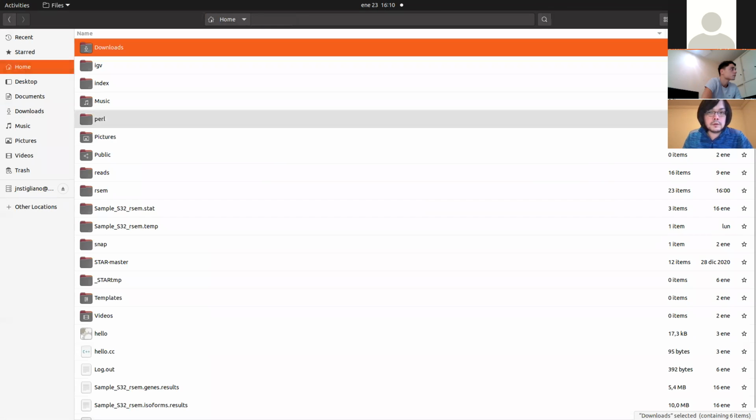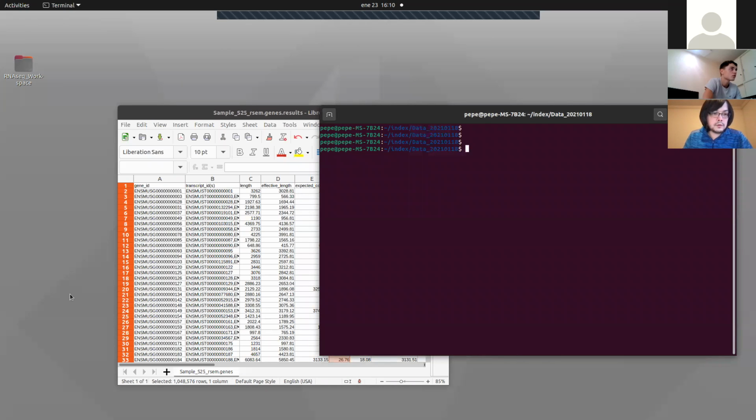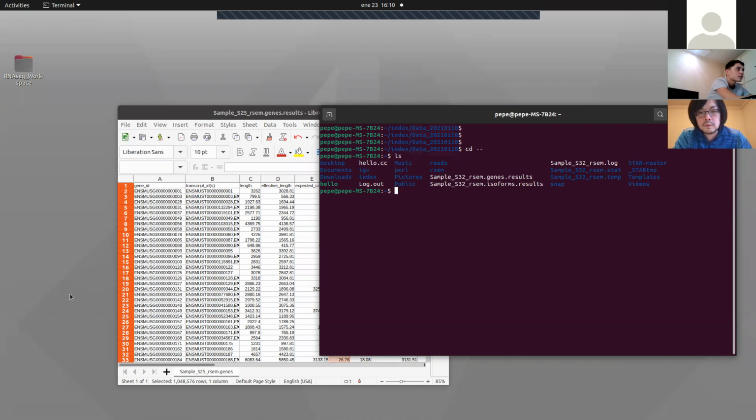Okay, good. So now we have to install some programs first. Sorry, if I do cd, go back here, and from here, ls. Then I have cd Perl. Just checking that I can do these things. Very good to know.